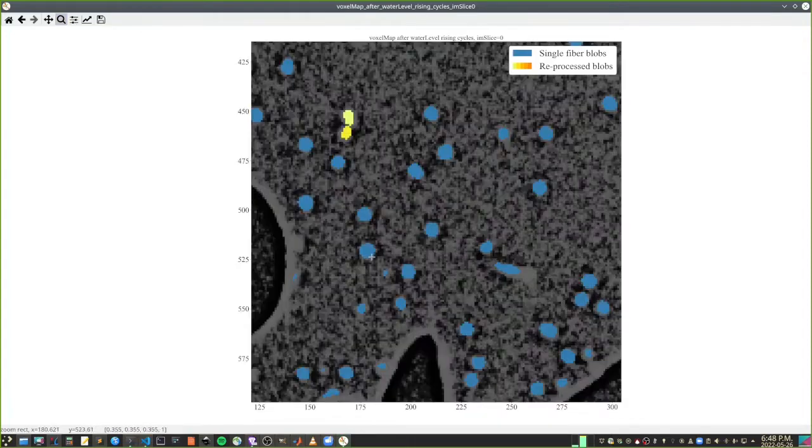I explain all this in the paper. Those that are roundish or oval are convex, and the ones that have an H shape or something like that are a bit concave. It's going to detect those and split them again with the watershed function.